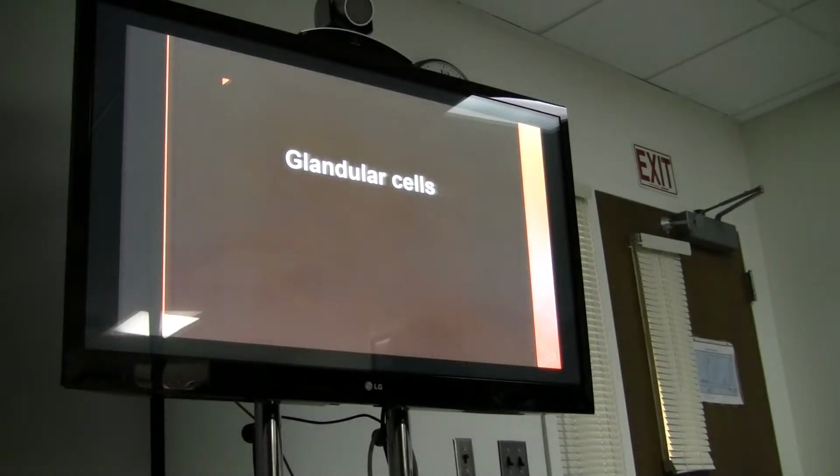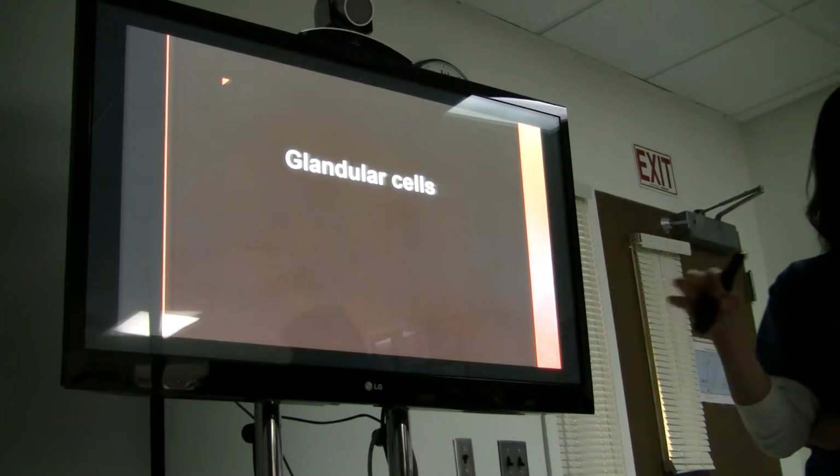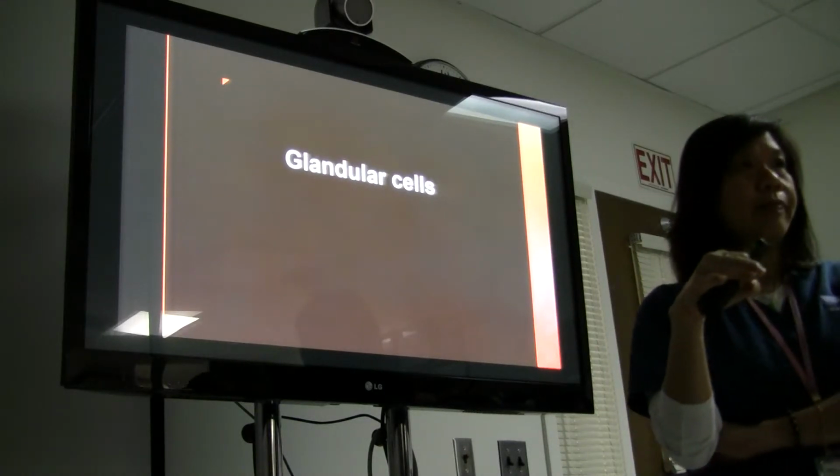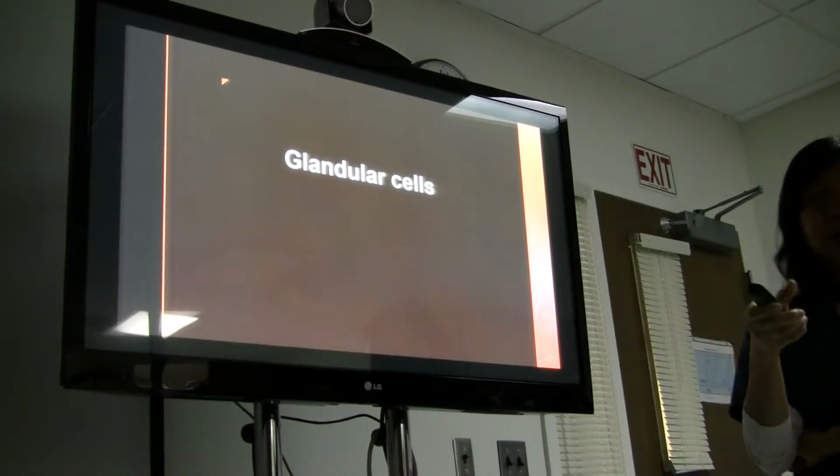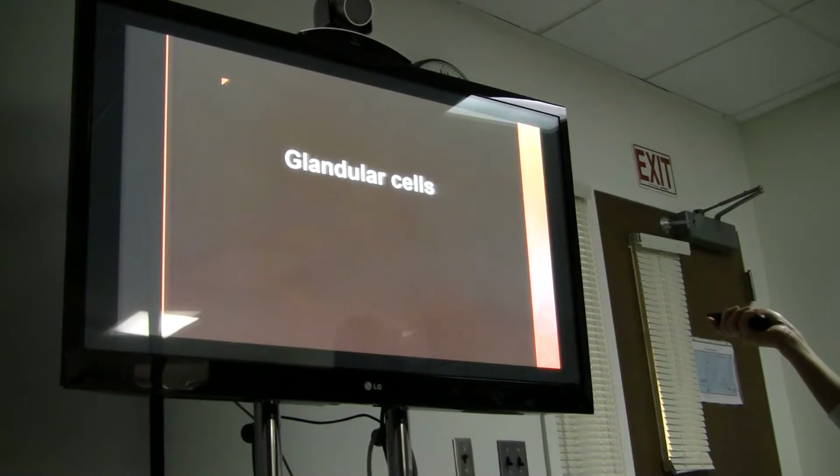Any questions so far on the squamous cells part? No? Okay. You can ask questions anytime. So now let's move into the glandular cells.